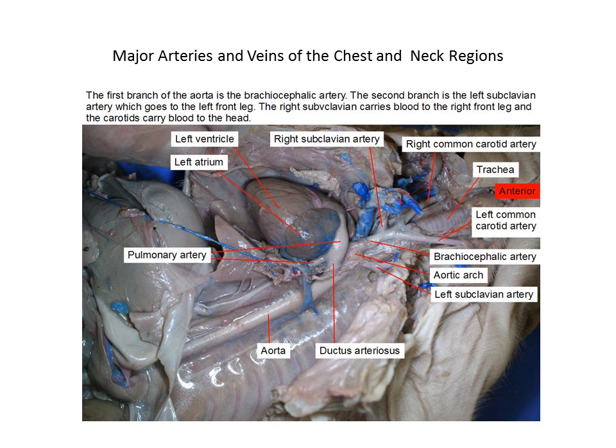Okay, so as you crack your pig open today, try to generate something like this. I mentioned you should be able to take out the lungs. That'll give you much better access to the back side of the heart. I believe this also has a good chunk of the ribs cut out too.